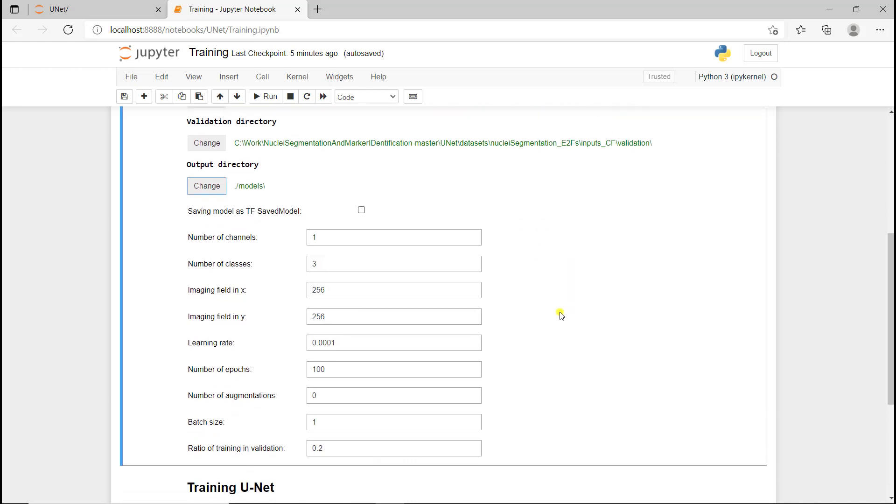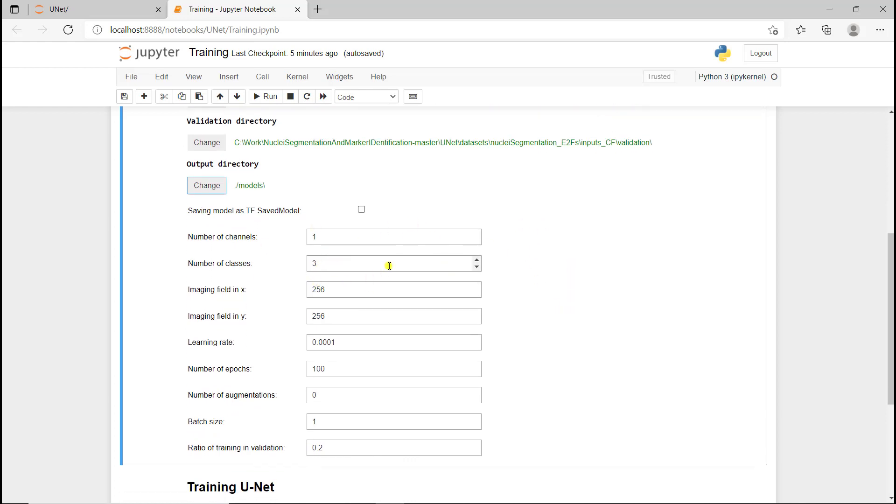The next parameters are related to data. We have one channel, which is DAPI, and three classes: nuclei, nuclei contours, and background. Then we need to define the imaging field. We have 512 by 512 images. We could define it as 512 by 512, but here we're going to keep it to 256 by 256. In that case, the algorithm is going to randomly crop each image into a 256 by 256 smaller image, and it's going to crop it differently for each epoch and for each image.